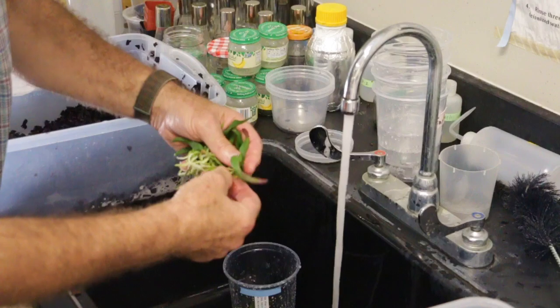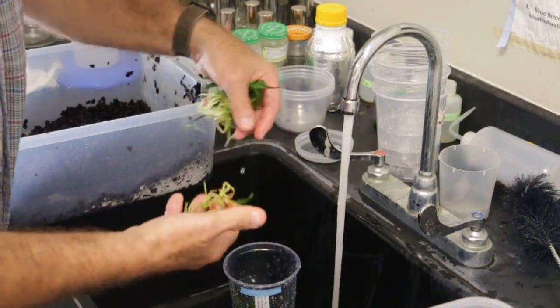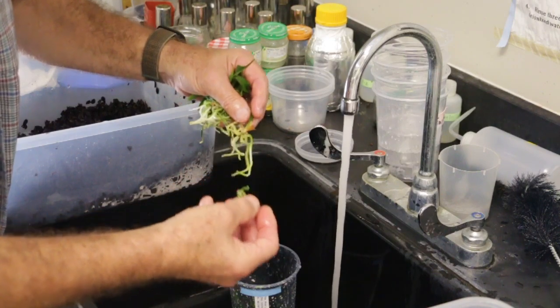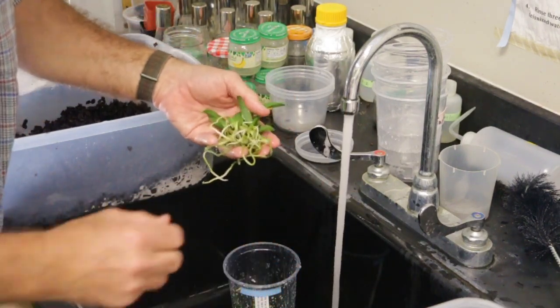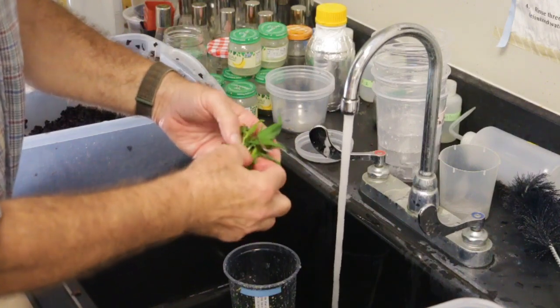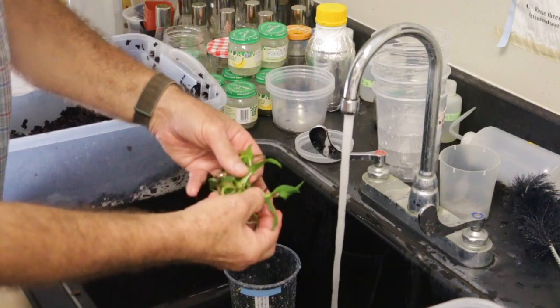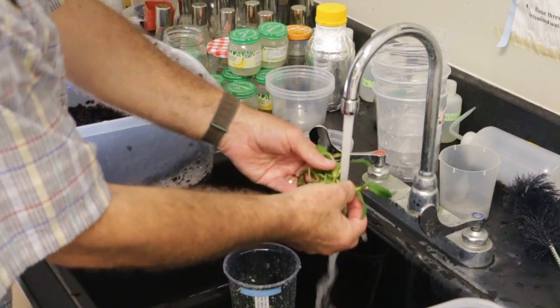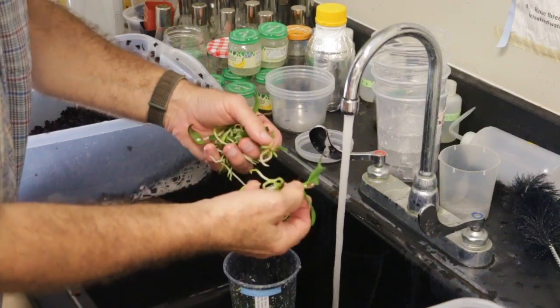All right. But what I do is just tease the plants apart. You just have to be careful. You tease them apart from the top, so you kind of wiggle them. You pull them apart a little bit, and you really won't damage them at all.